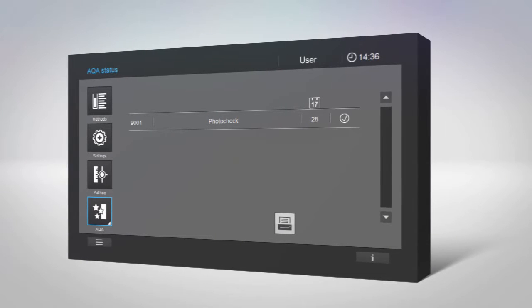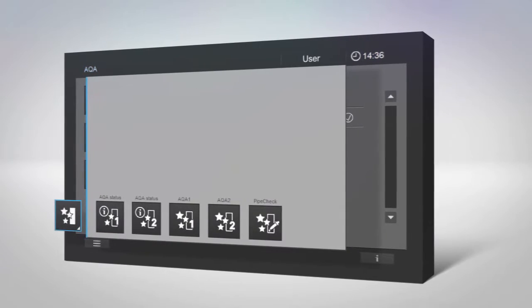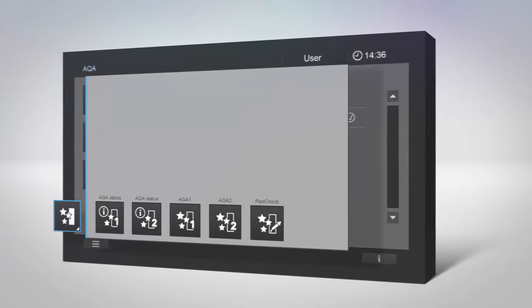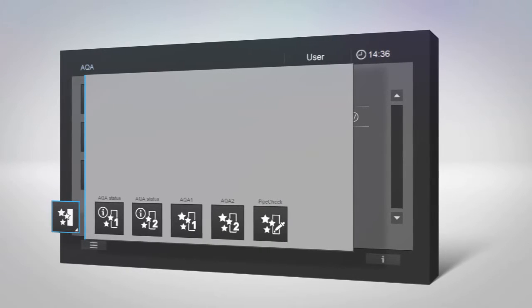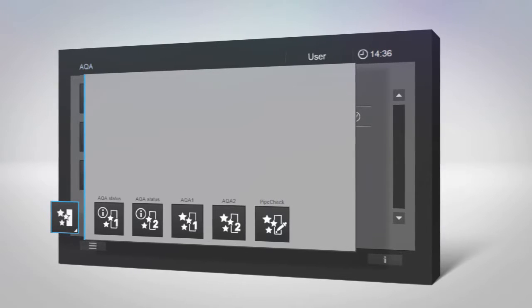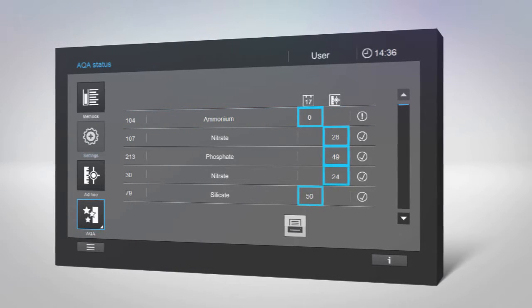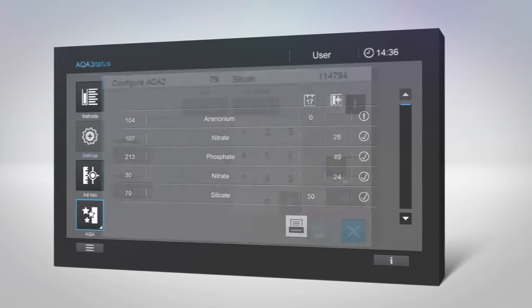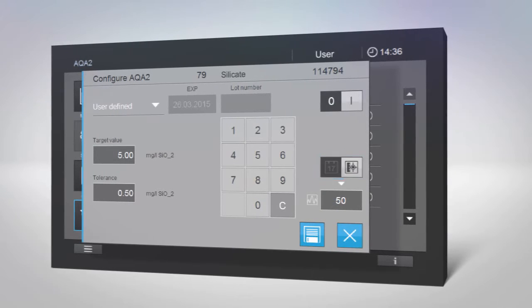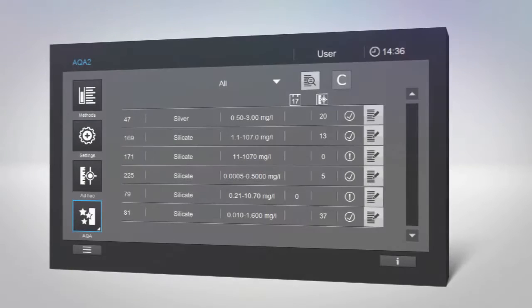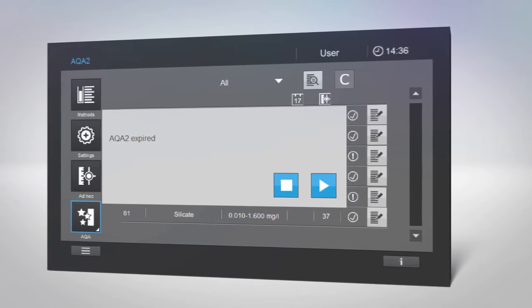AQA Prime makes analytical quality assurance exceptionally secure and extremely easy. Tap the AQA icon for a clear overview of AQA status, information, updates, and options. AQAs can be activated, paused, or reactivated at any stage to suit your schedule. To check the validity of AQAs, select Status in the AQA menu. You'll see at a glance which AQAs need to be updated and when. All device and system checks can be handled completely independently of each other. You can set a period of time or a number of measurements between AQA updates. If you are about to perform a measurement using a method for which you set an AQA, you will be notified if the AQA has expired.